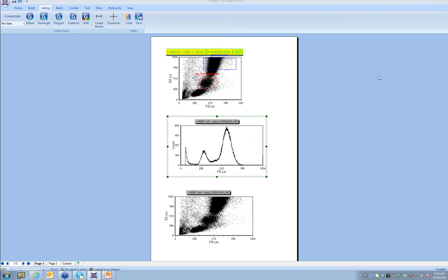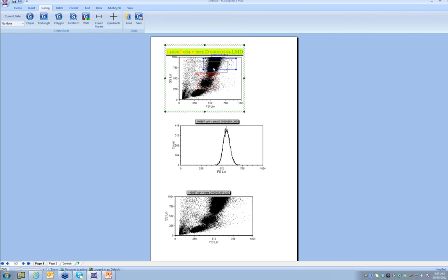And then what you can do is go up to our gating drop down here that's on the gating tab, and you can see that no gate is currently applied. So I could just drop down and select the granulocytes gate, and you notice here now that the plot is updating with the granulocytes gate. Okay, and I can go here and change it to my first population, and then the plot is updating with the my first population gate.